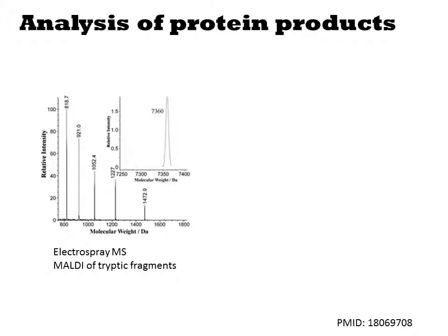Like any product study, the first step is to purify the component you wish to analyze. Because the target is a protein and we have control over its gene sequence, we can add a his tag to it and purify it by nickel NTA chromatography. Just like with the small molecules, there are mass spec methods for detecting protein products. The LC-MS setups used to monitor small molecules typically don't work for larger proteins. It's a more expensive mass spectrometer for proteins, but the basic idea is the same.